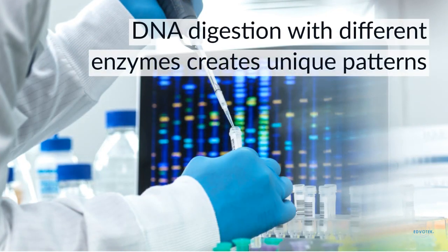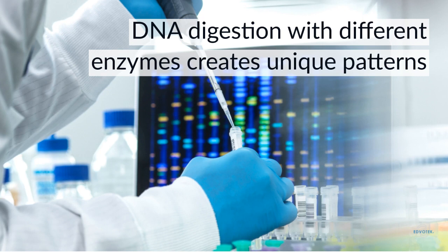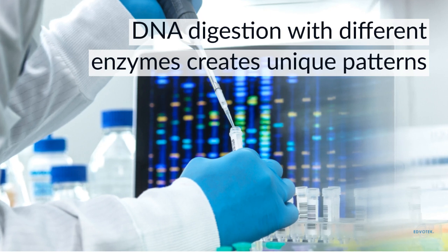Digestion of the same DNA with different enzymes creates unique patterns that can provide information about a gene or a genome without knowing its sequence. This was essential before DNA sequencing became more inexpensive and readily available. In fact, this is the principle behind DNA fingerprinting.